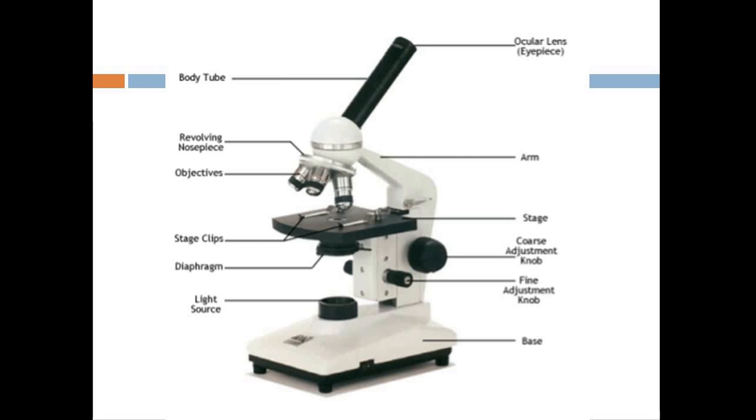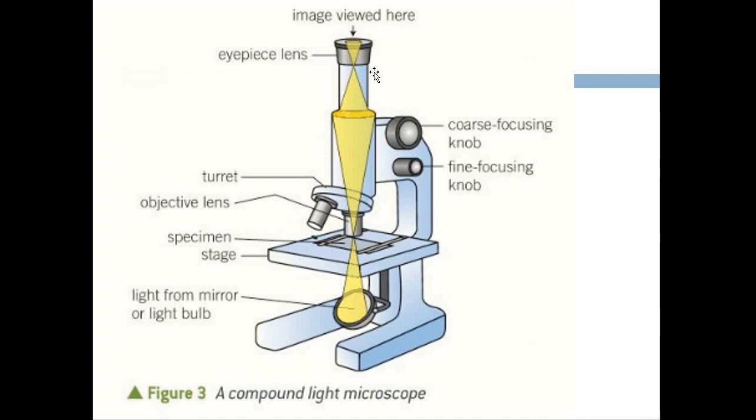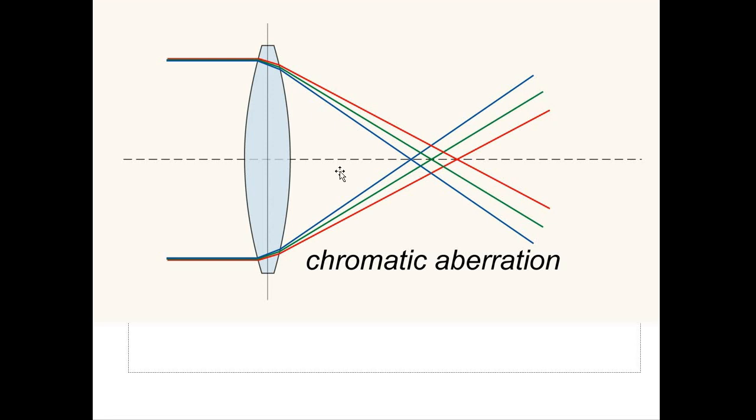Okay, so moving on. I just want to give you a bit more detail in terms of the way the lens works. The key point with this combination of these two lenses and these distances of the lens is this reduces something referred to as chromatic aberration. Now, this is something you need to learn. Every time light is used, and we use white light, which is a mixture of wavelengths, and it passes through a lens, it will refract, but it also will start to disperse. It will spread apart because the different wavelengths bend at different amounts, or change direction rather than bend.